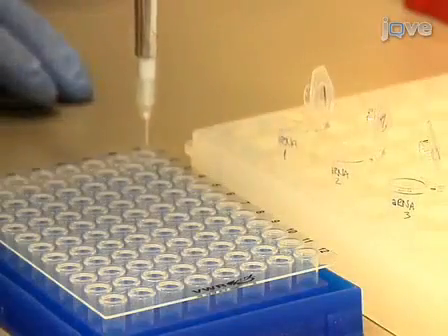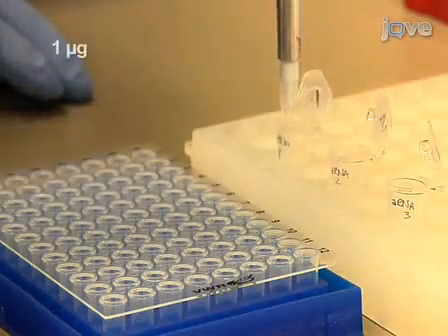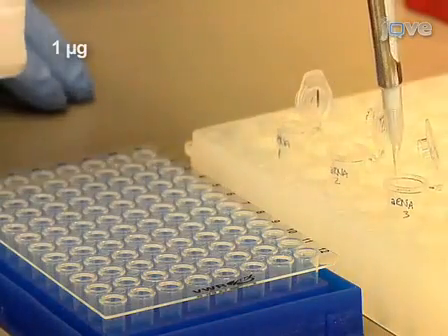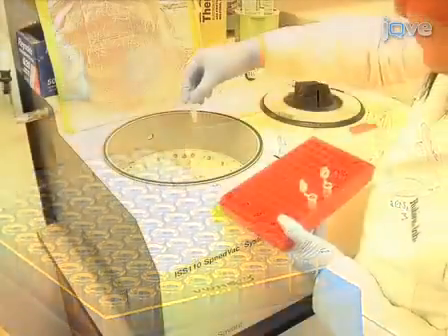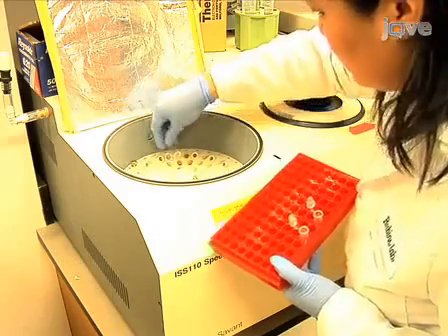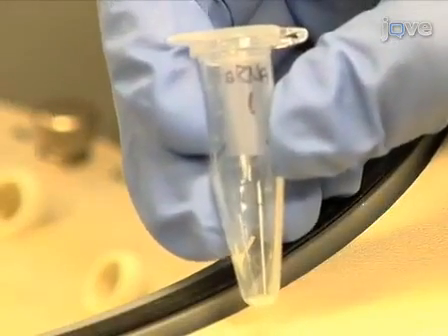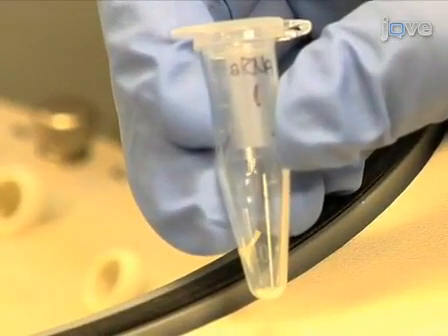To begin aRNA labeling, first add 1 microgram of the aRNA samples into 1.5 milliliter microcentrifuge tubes. Vacuum dry the samples on low or no heat until they are completely dry. Cap each tube as soon as it is dry. It is important to not over-dry the samples.